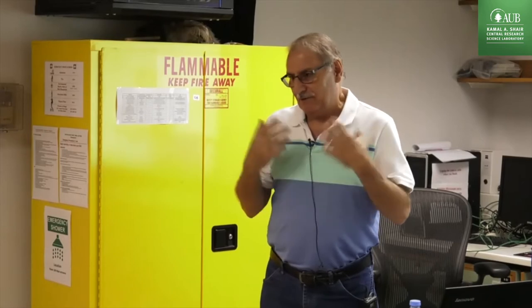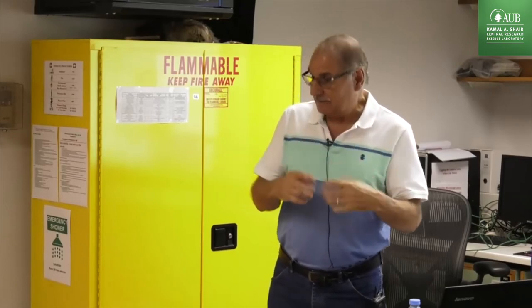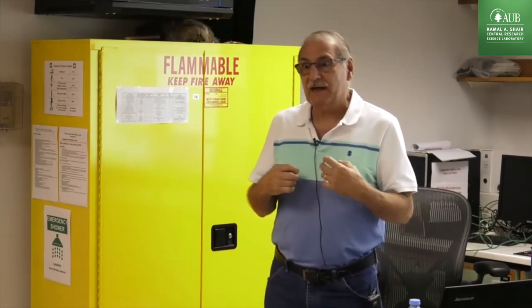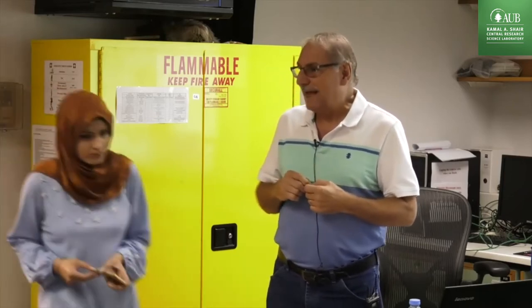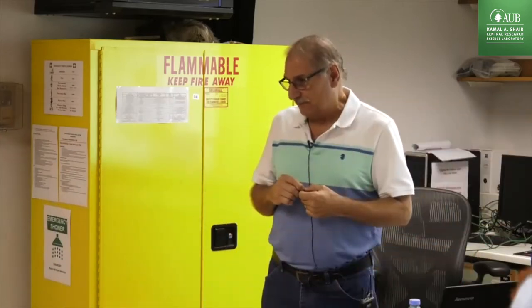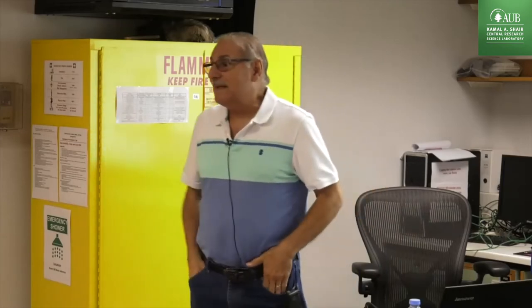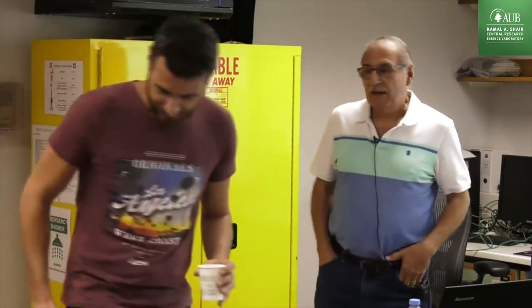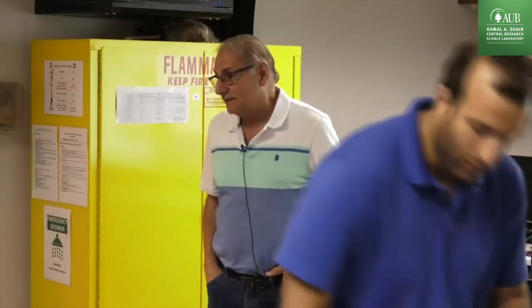Okay, you have maybe heard about formation of spinel. Spinel, for example, the alumina can interact first and then react with the nickel to form the nickel aluminate. The nickel aluminate is called spinel, and you cannot reduce it anymore, so you lose them. So if we lose them, what would happen is you get less nickel on the surface, and the nickel has to be reduced. It has to be reduced to zero, and if you are not able to reduce the nickel, you will not have active site on the surface.